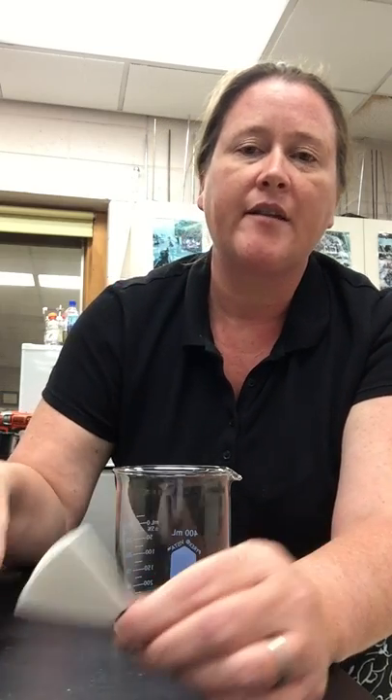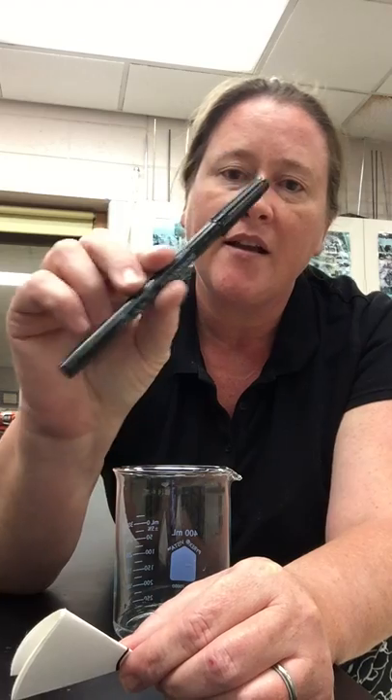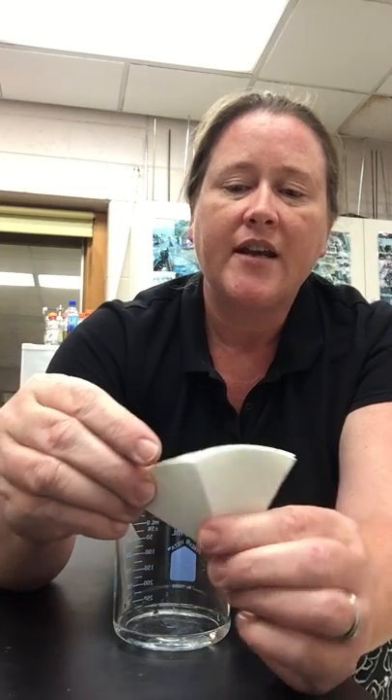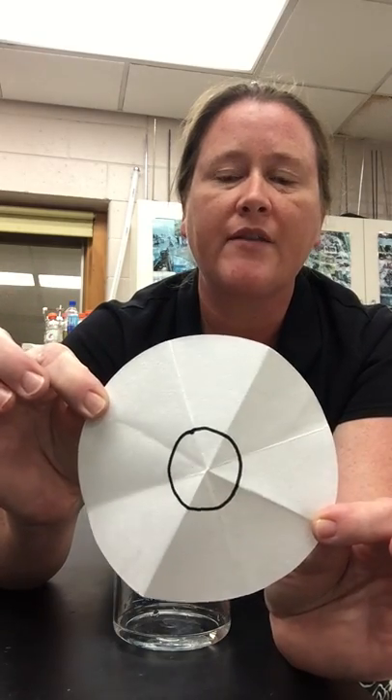The mixture we're going to be separating today is the mixture in black ink. Black ink is composed of many different colored dyes. What I've done is I've taken this piece of filter paper, found the center point, and drew a circle around that center point.